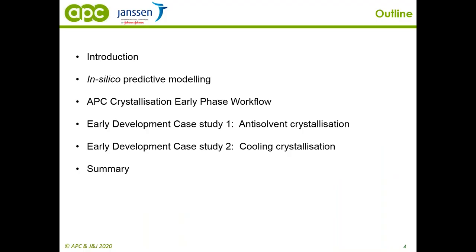But before I go to the case studies, I would first like to introduce you to the topic, then present a little bit on the in silico predictive modeling, which is an integral part of our early crystallization development. I will also introduce you to the workflow, which combines in silico screening and smart experimentation. And then I will demonstrate our workflow on two case studies, two proprietary API molecules. One is an interesting example of anti-solvent crystallization, and another one of a cooling crystallization. So this is what I planned for today.